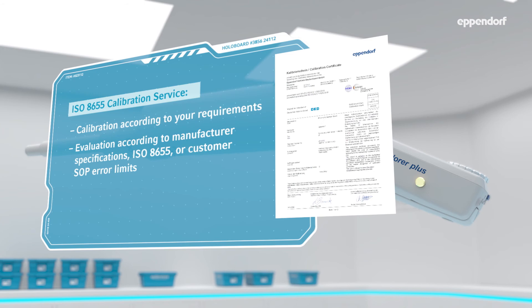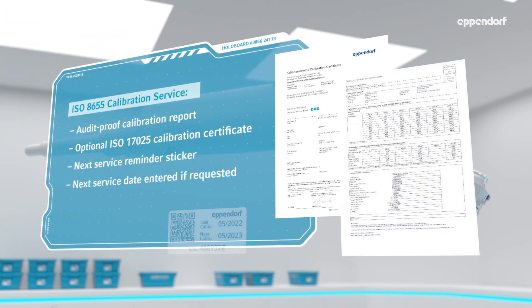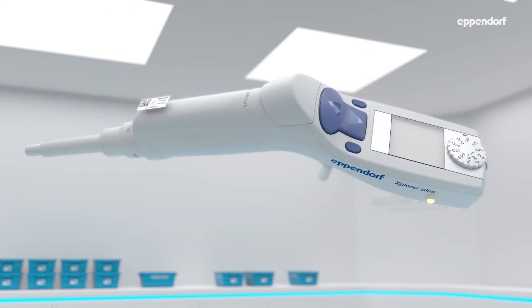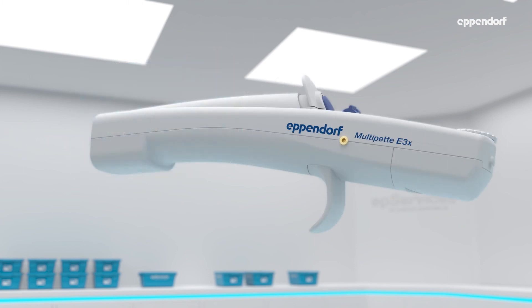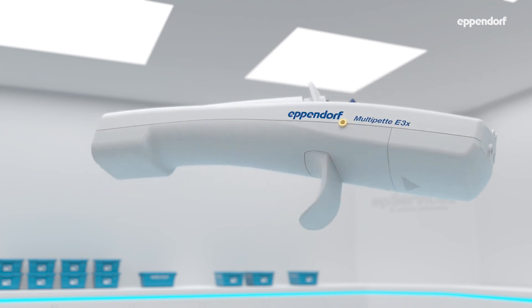This electronic pipette is now ready for calibration. The electronic and software function tests are also applicable for our electronic multipet E3 and E3X pipettes.